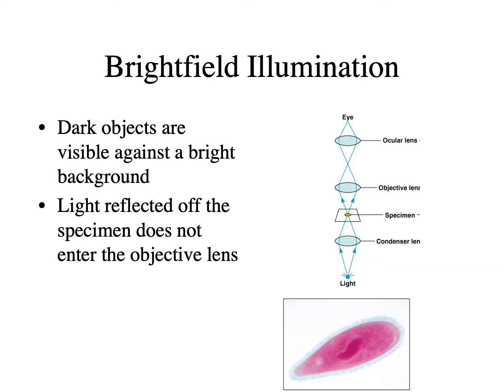Okay, so for some different types of microscopes, I don't want you to go too much into the physics here, but I do want you to recognize images that are coming from different types of microscopes. So the first is bright field, and it implies that the field of view is going to be super bright, like white light. So basically the light is going to come up from the bottom of the microscope, hit the specimen, and the specimen will be dark because it's absorbing or blocking that light against a white background. This is your typical cheapo lab microscope style, a bright field compound microscope.